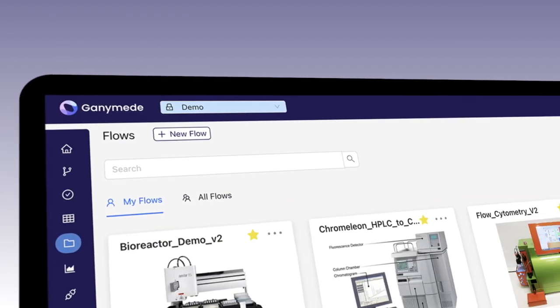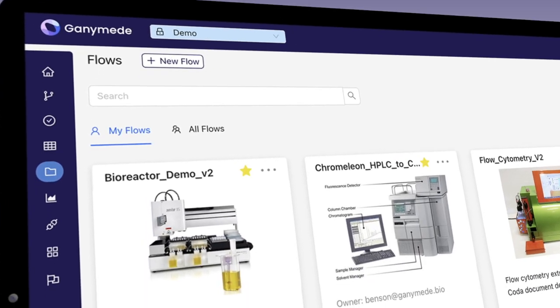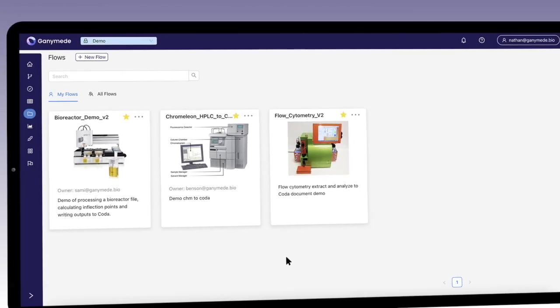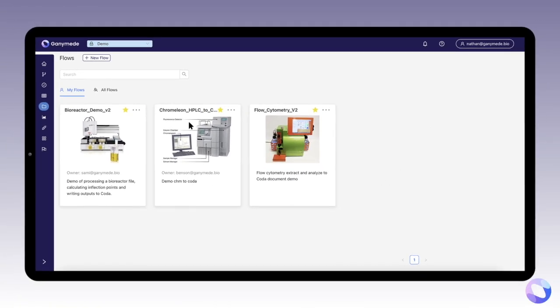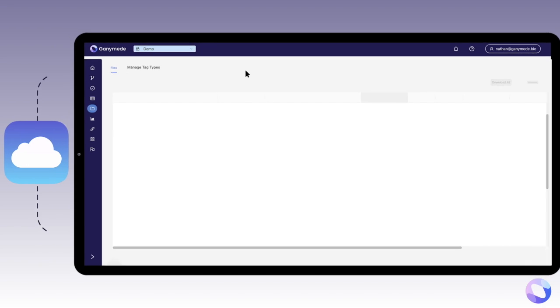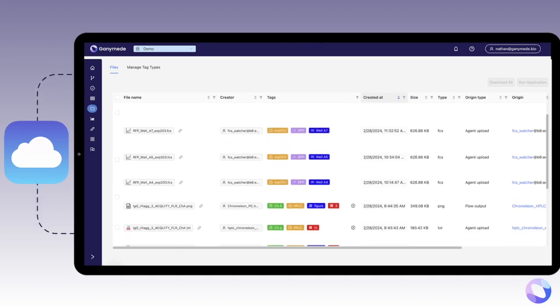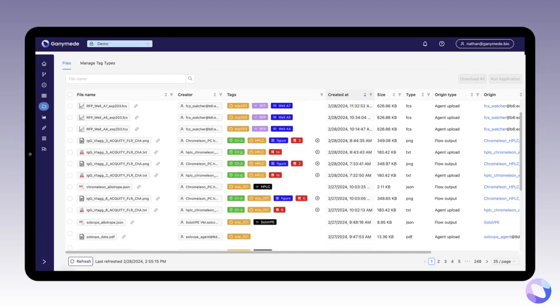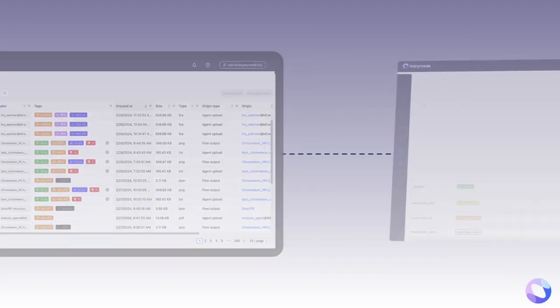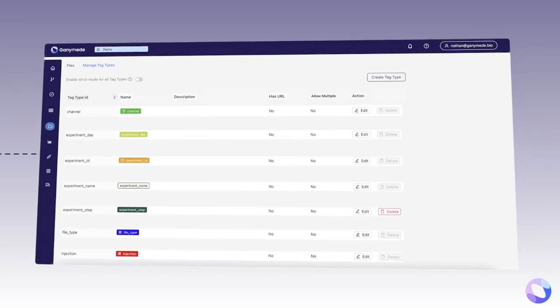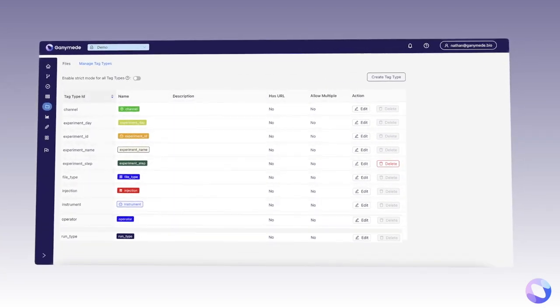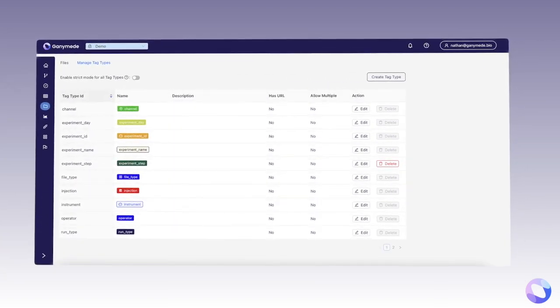Let's say you're running samples on an HPLC. With Ganymede, you can automatically load worklists from your ELN. Ganymede then automatically captures the results in the cloud associated with the sample context. Ganymede's file system has rich, scientifically aware tags that make searching a breeze.